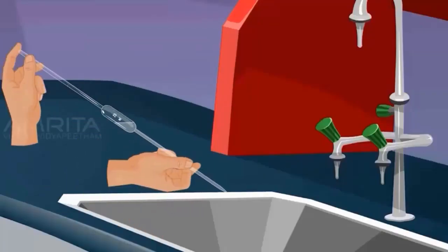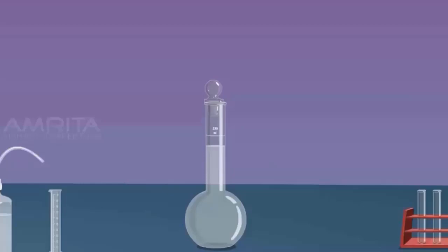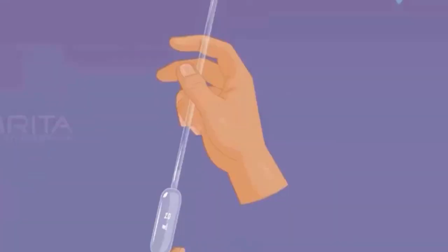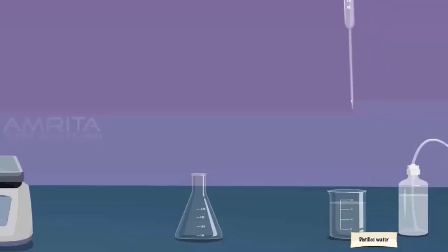We place it in a sink. This rinsing is done for the titration process to be accurate. And then we take the required volume from the analyte using a volumetric pipette. We introduce this volume into an Erlenmeyer flask.